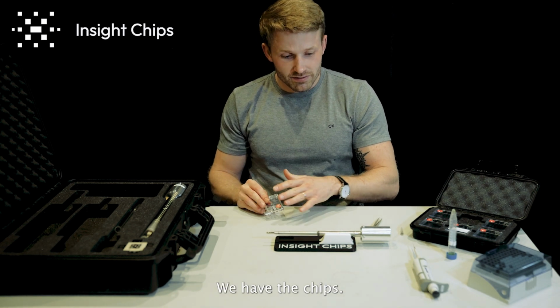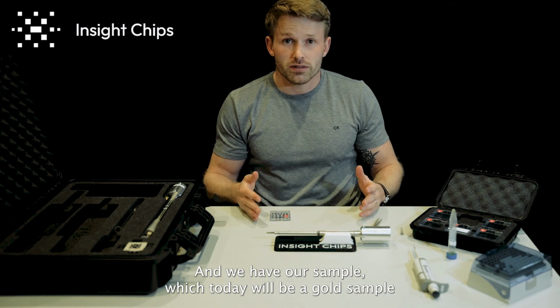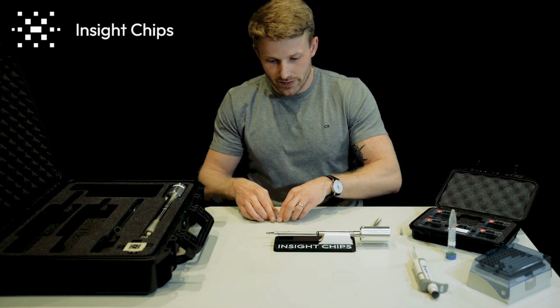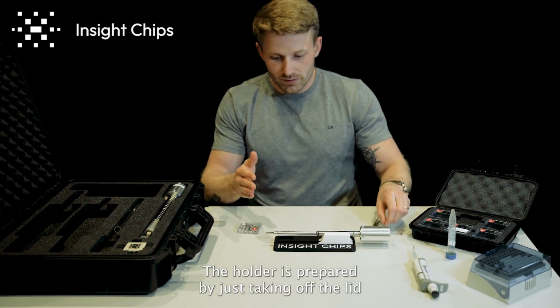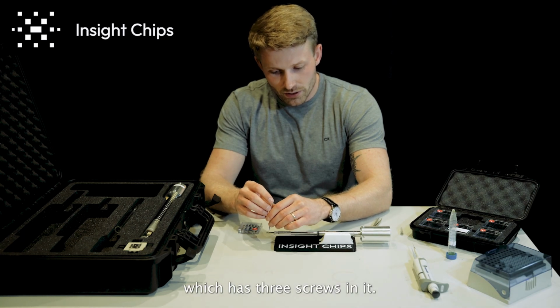We have the chips, we have a holder, and we have our sample, which today will be a gold sample, which will nucleate crystals under irradiation of the beam. So the holder is prepared by just taking off the lid, which has 3 screws in it.